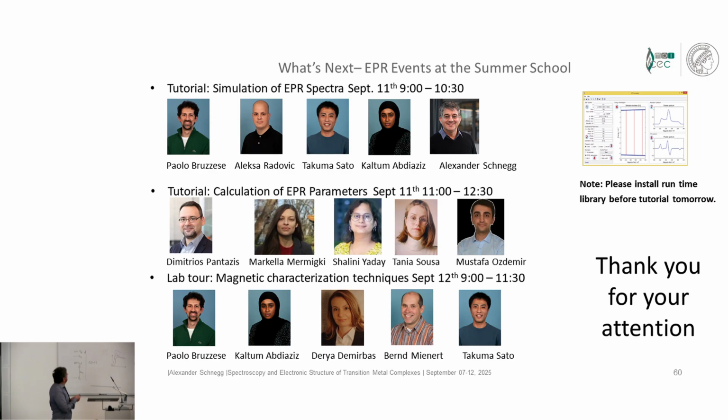There is an additional tutorial on the calculation of EPR parameters by Dimitrios Pantazis and his co-workers, which shows you how the parameters which you extract from your EPR spectrum can be actually related to chemical information and structural information.